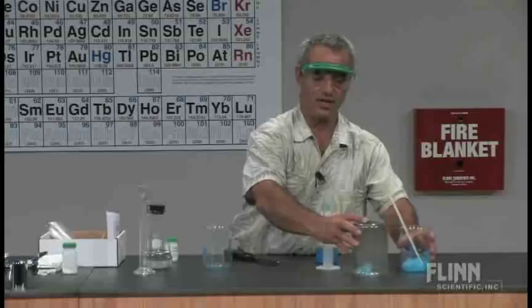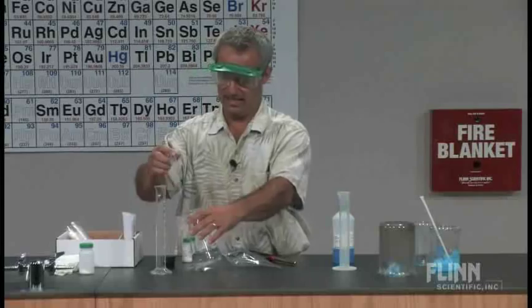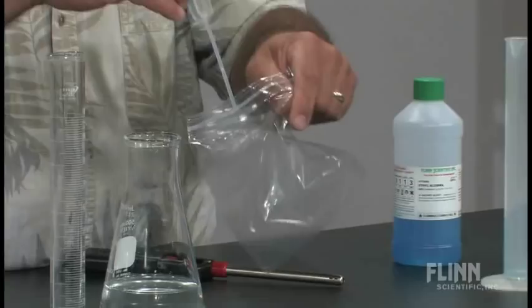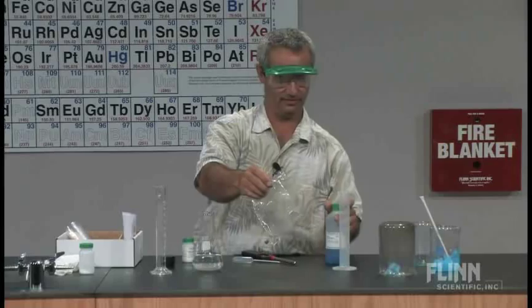I've come up with a variation on that. Because that's great, but what if you want the students to experience it firsthand? And I mean firsthand. You could also do this in Ziploc bags. It works great. So I'm going to take one squirt of my calcium acetate solution, same stuff I used before. That's in one corner.